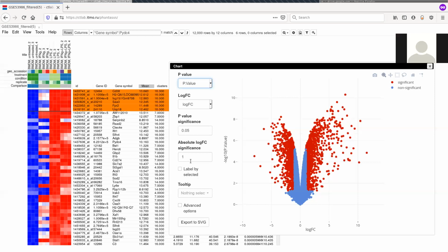From a bioinformatics perspective at least, in the blue part, these genes are not significant, either statistically or biologically. However, remember that it doesn't mean that the red genes are biologically significant. If you do knockouts of these genes, nothing may happen. Well, something could happen, but not in your phenotype. So there are a lot of genes, and probably they just happen to change for whatever reason.